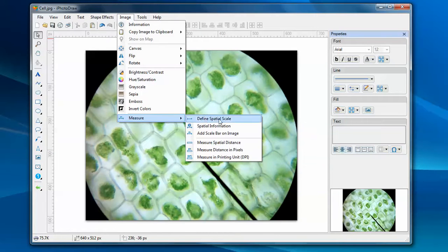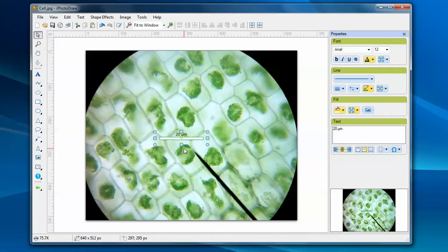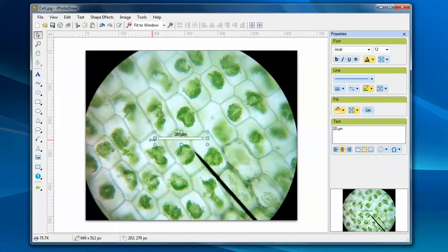Let's go back to the menu, and you will find out this menu item is now enabled. Let's click on this menu item and the scale bar is created. I can drag this scale bar to change the size. When I'm dragging the scale bar, you'll find out the value on top of the scale bar is updating automatically.